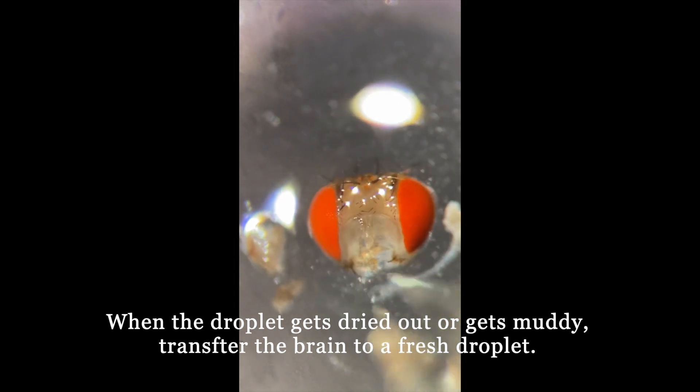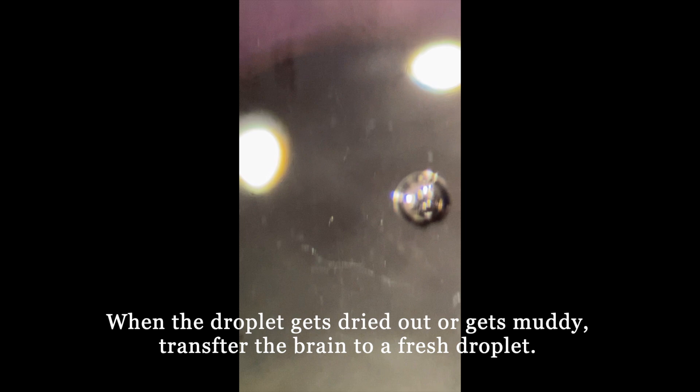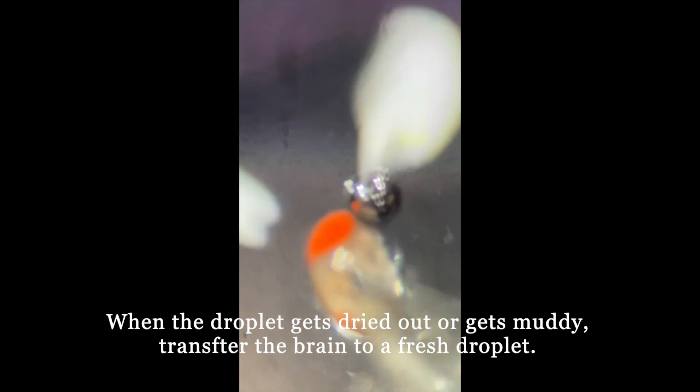Be careful when a droplet gets too dry or gets muddy. Then, we need to transfer the brain into a fresh droplet.